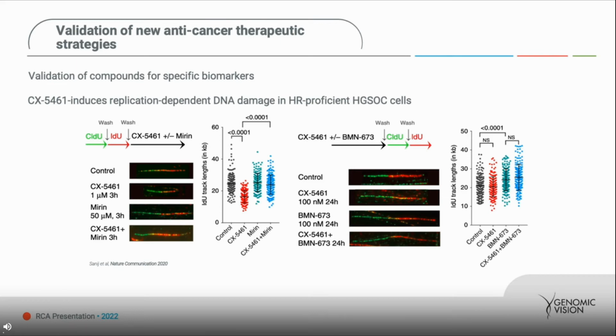On the other hand, the PARP inhibitor, talazoparib, which is called in this case BMN 673, increased fork progression. And this was confirming that PARP inhibitor mediated acceleration of fork elongation is a mechanism for replication stress and DNA damage. As you can see with the BMN 673 plot in green, and later on with the blue plot with CX5461.